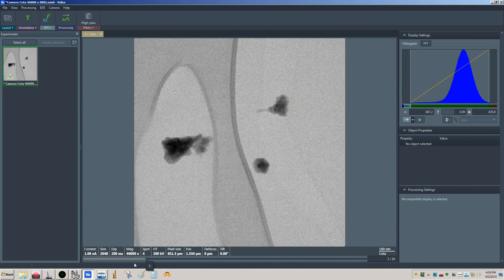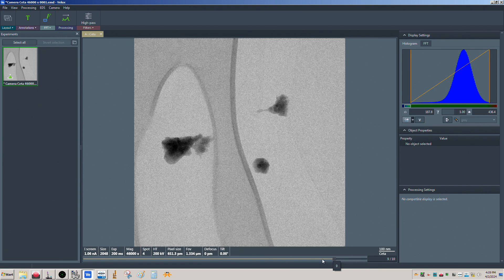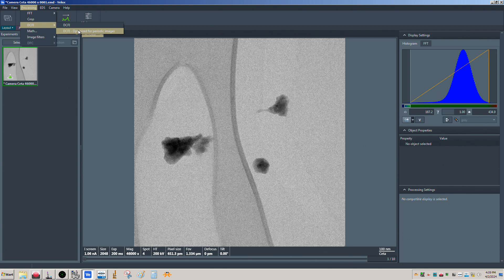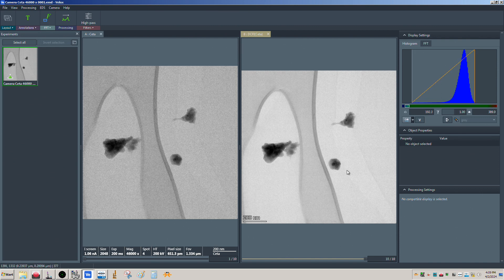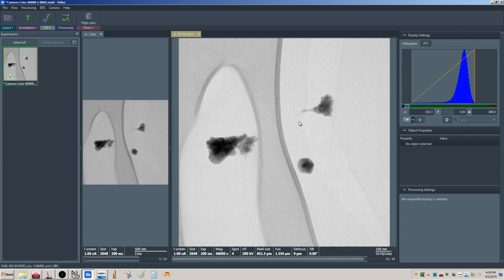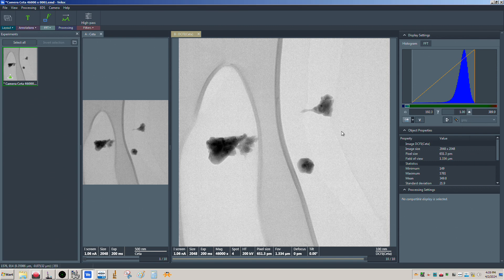We'll go to the processing window. These are the individual frames. Come up here to Processing, go to DCFI. Unless you're seeing lattice or near-atomic level detail, you don't need to worry about the second option — just use normal DCFI. You can see it adds the frames together and we get nice signal-to-noise. The histogram is showing the average for one frame, so if we added them all together we should see 10 times what's shown here.